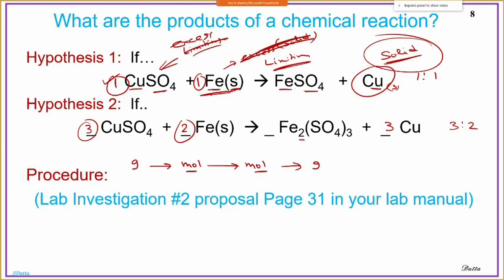So iron filing, that is a very good point, because when you write the lab report, you're going to justify. That means you have to know the possible sources of error. So I'm going to give you a clue and I will explain again tomorrow. Because the iron filing, what you will see tomorrow, like blackish brown, that means that may not be 100% pure, maybe 95%. Okay, so that's one of the possible sources of error.